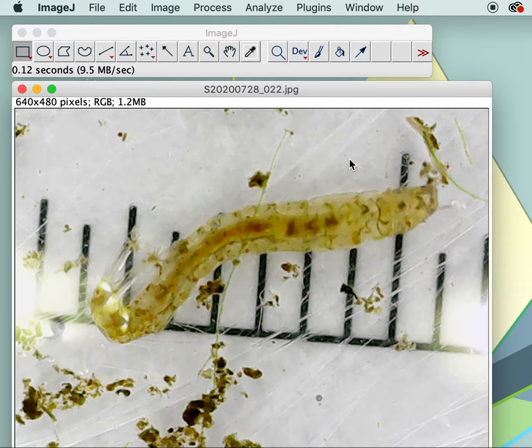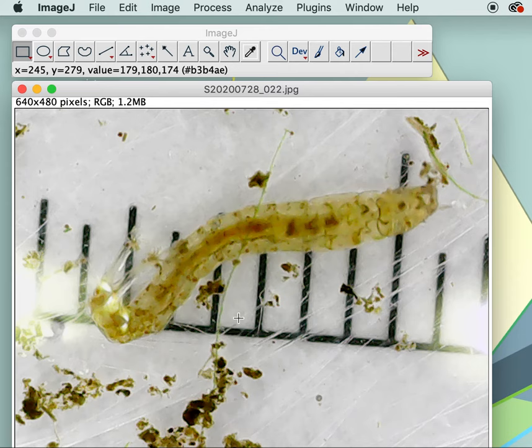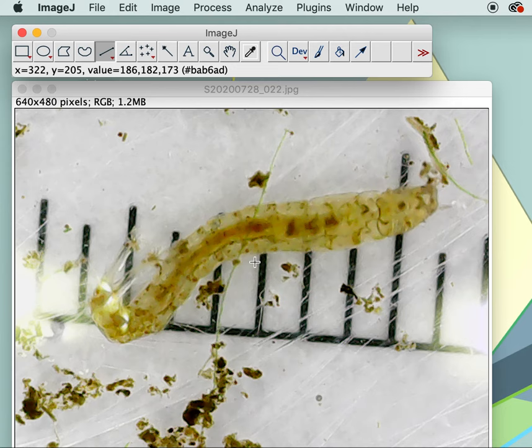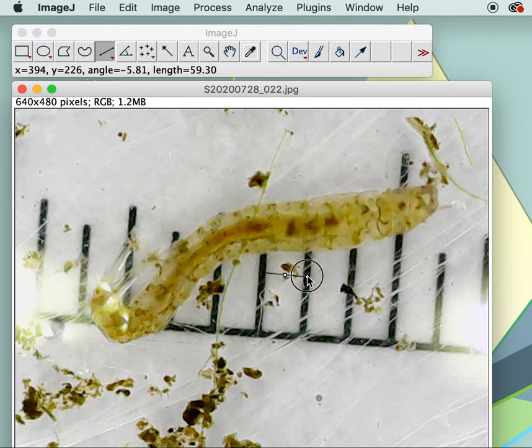Before we measure, we need to tell the computer how much a millimeter is, and that is why we have our millimeter scale bar that we took along with the picture. So what you need to do is select the straight line tool and carefully measure across to our one millimeter mark.